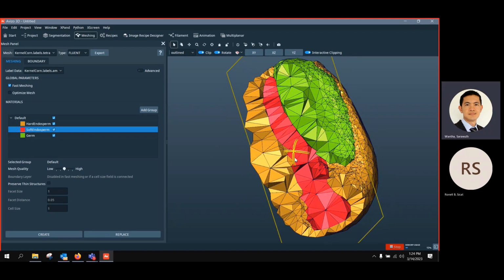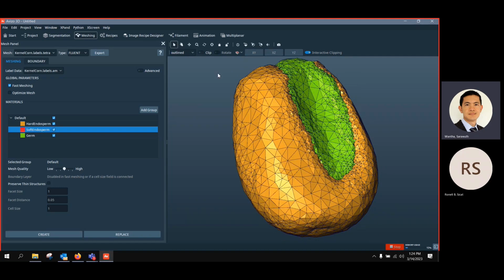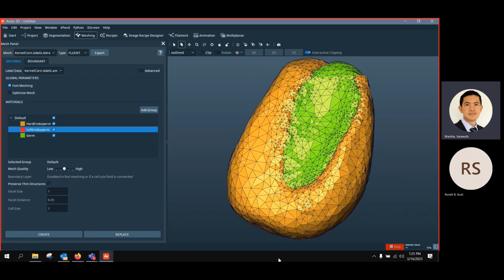Some people usually use it, yes, that's a good question. So I deactivated it. What you could do when you have the mesh here is export it for further analysis, like finite element analysis. I'm not sure if you use finite element analysis or fluid dynamics computation, but for finite element analysis, you create the properties and generate some computation on the mesh. For example, you want to create boundary conditions for the mesh, and you export it into another solver.